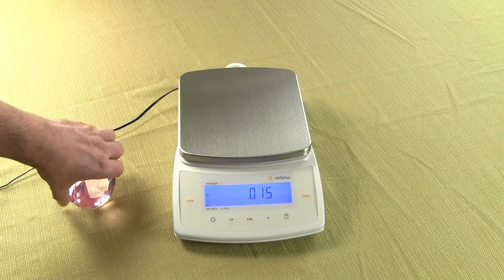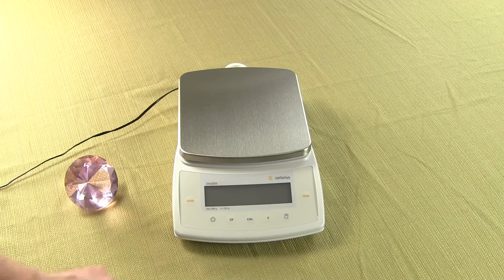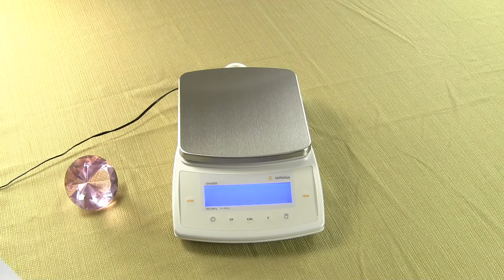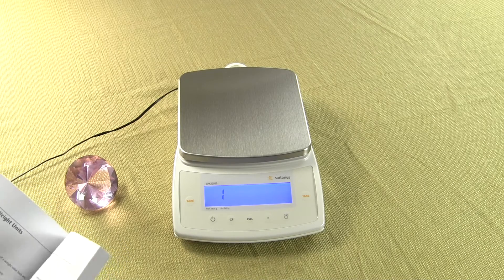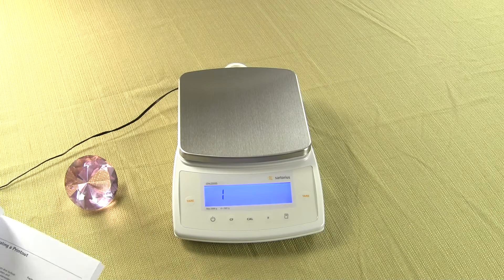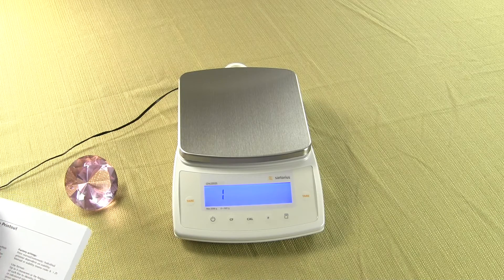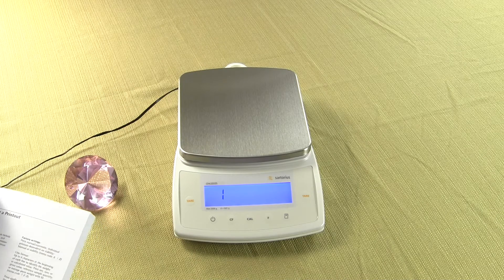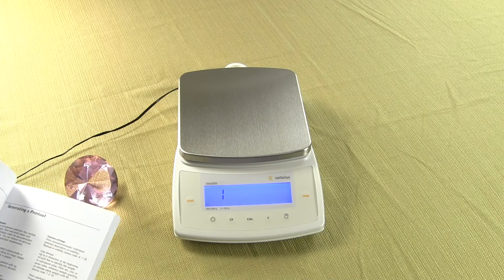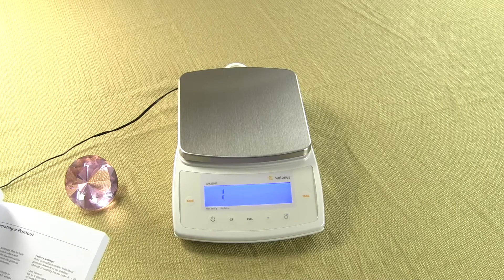So let's do this one more time to show how easy it is to change the weigh mode. One powers up the balance and hits the tare key. When you hit the tare key, the first segment shown is a 1. So this time, let's change our primary mode — which was grams — and change that to pounds. The code in the manual for pounds is 175.